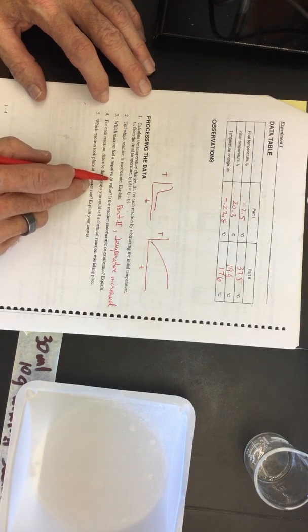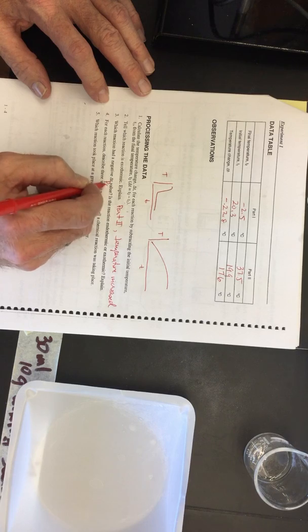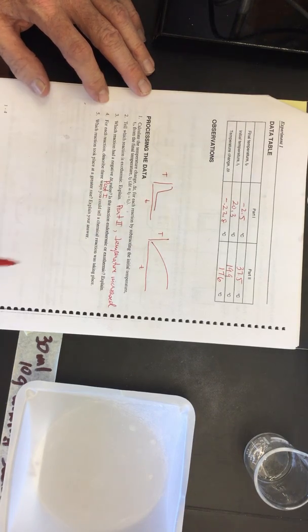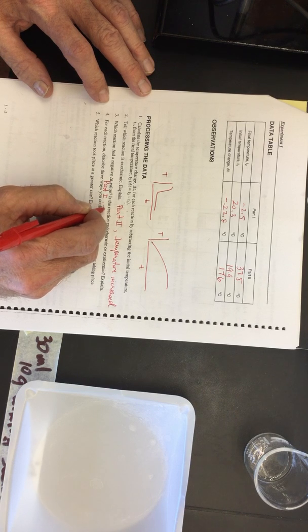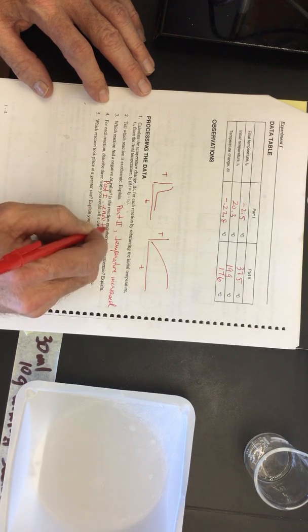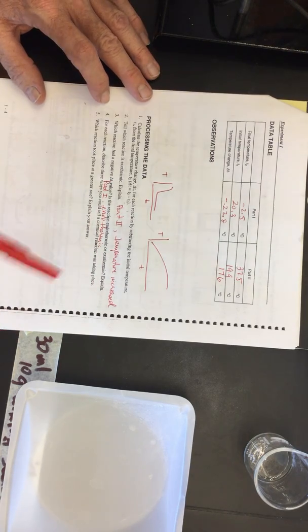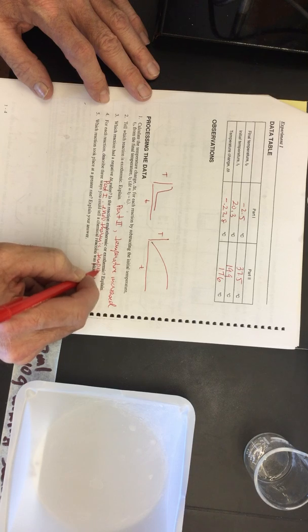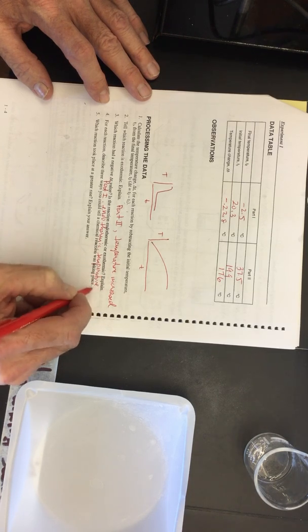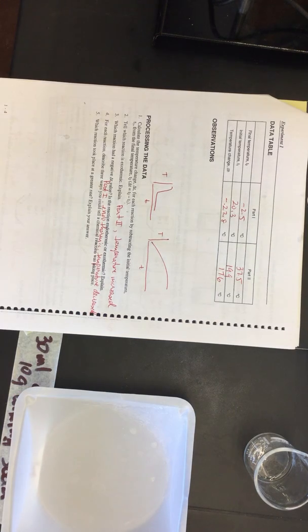Which reaction had a negative delta T? This is part 1. Is this reaction endothermic or exothermic? We can say that it is endothermic. It's the opposite of an exothermic. What happened to the temperature? For an endothermic reaction, the temperature is going to decrease. It feels colder.